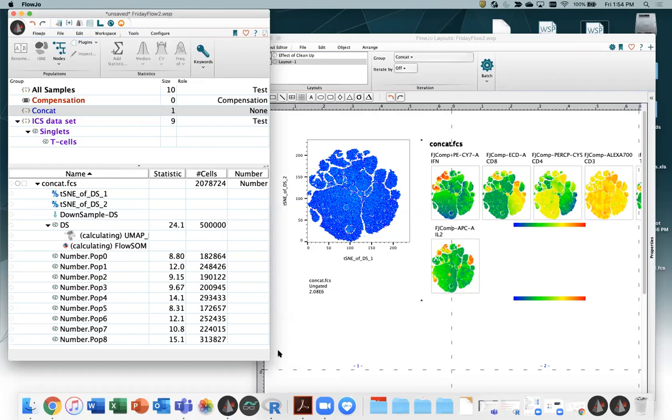So processors, the more you can get, the better. There's no minimum requirement there. You can run with 2 processors, that's fine. I don't think you can buy a 1 processor machine anymore. If you get more, it'll be a lot faster. Pretty much processor speeds are the best to the worst. There's not a whole huge difference. They're all in some large number of gigahertz.